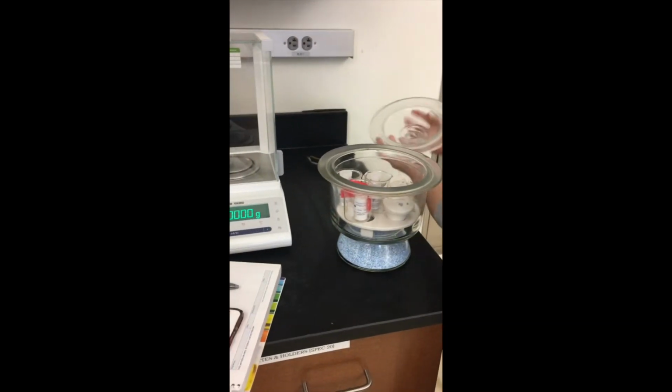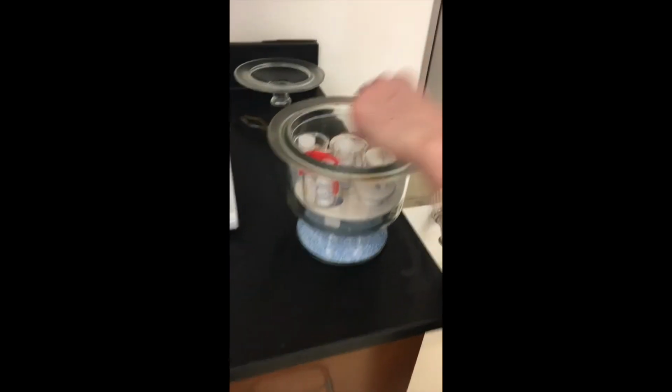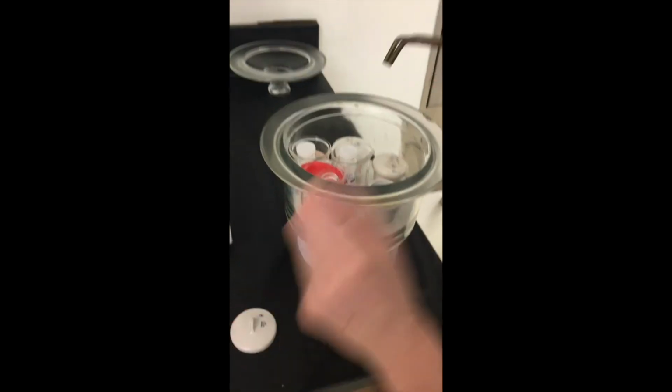After about a day, come back and weigh your dried crucibles, placing them in the desiccator to cool for about 10 minutes before weighing.